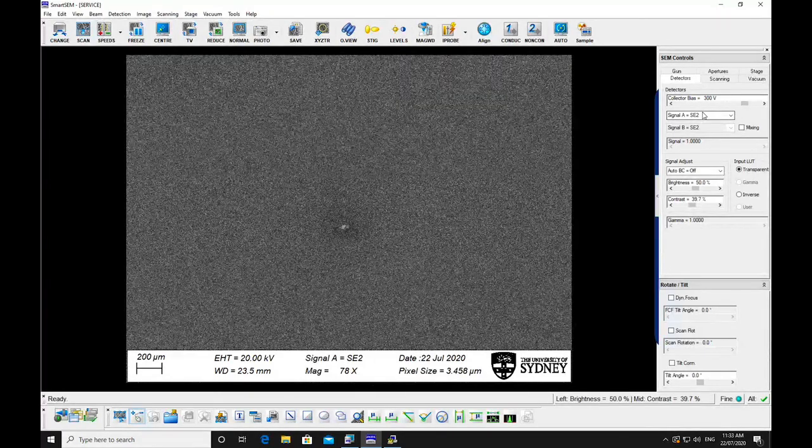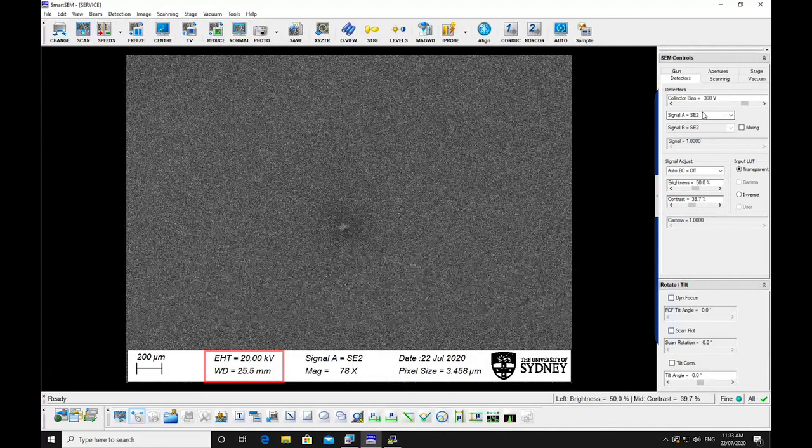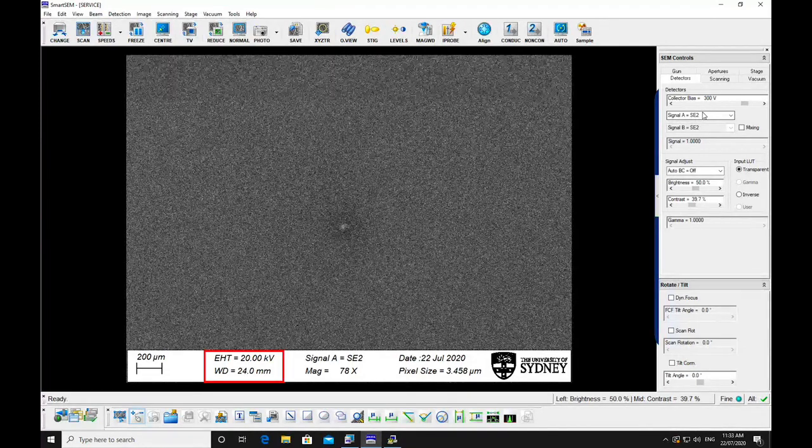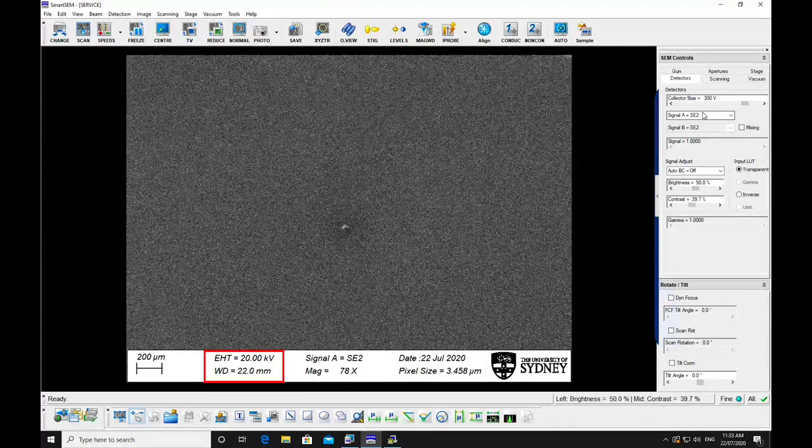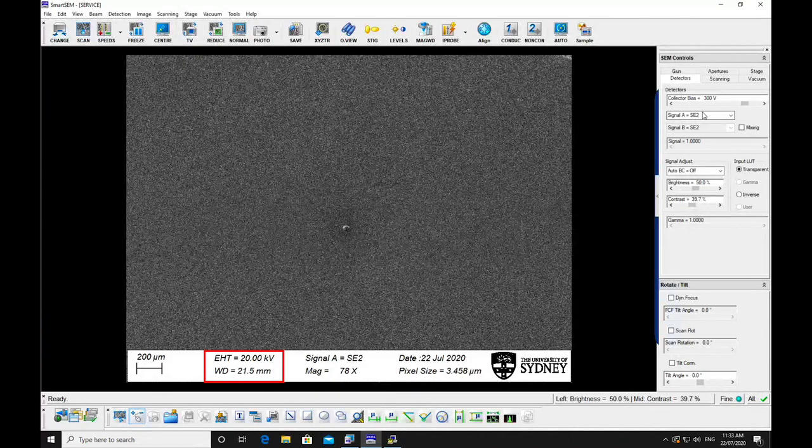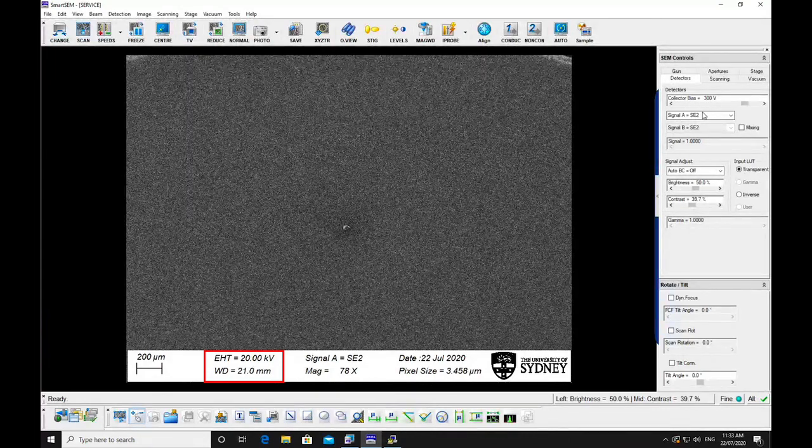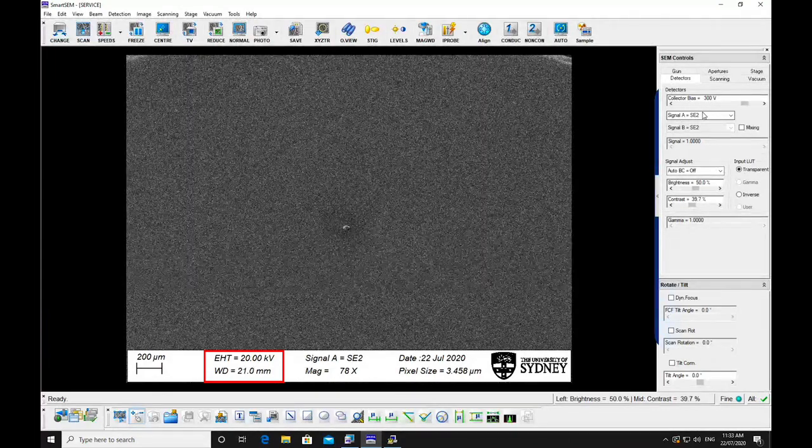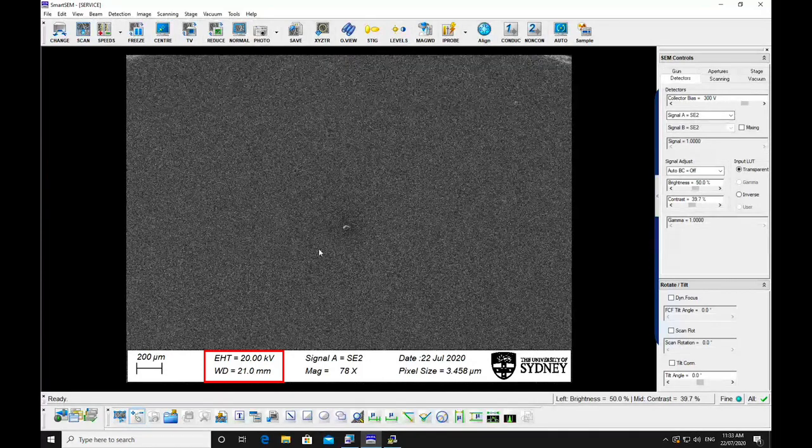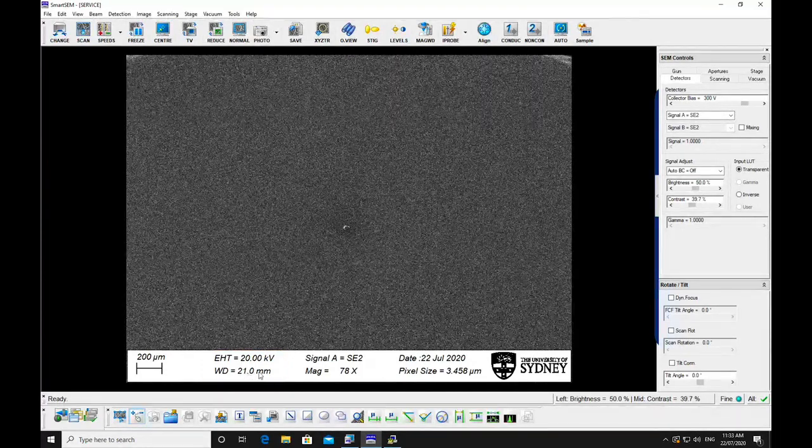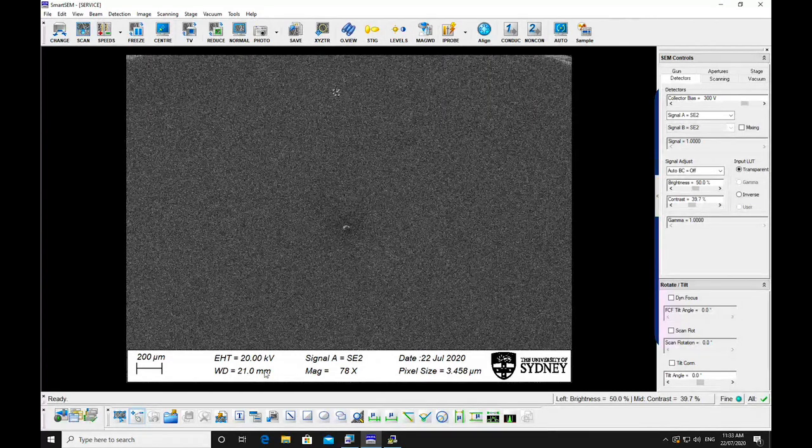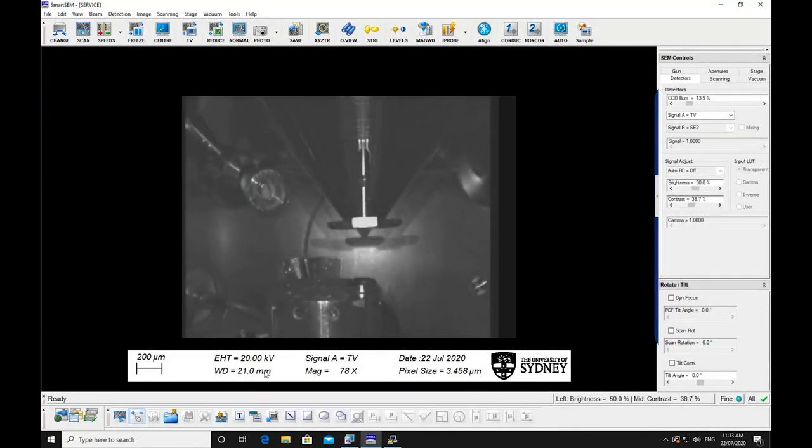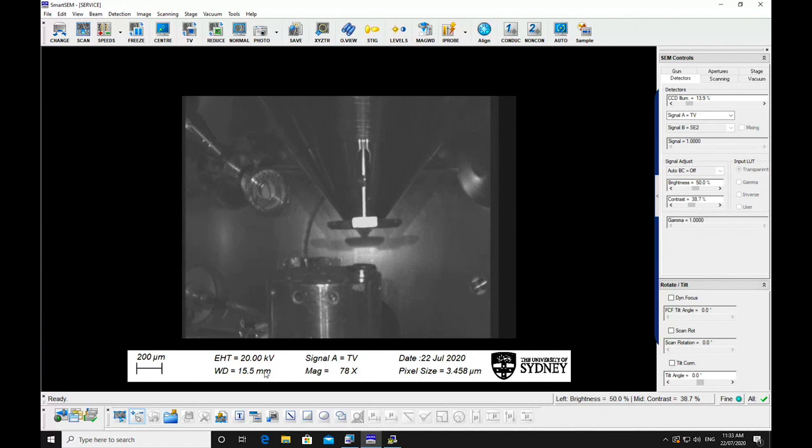Focus the image. The software will then be able to calculate the working distance displayed on the screen. Switch to chamber camera view and move the stage to a suitable working distance. Maintain a working distance between 5-10mm. Make sure that none of your samples are higher than this.